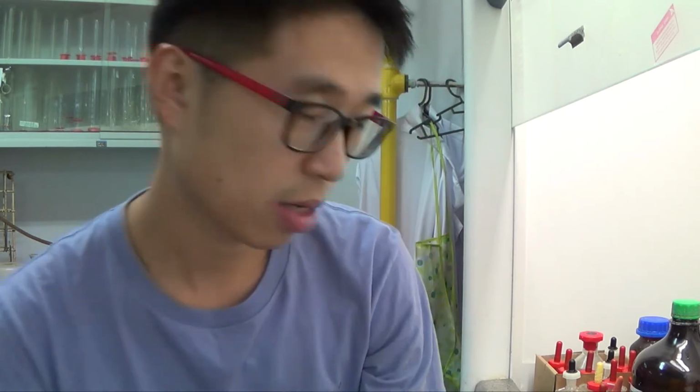Hello guys, so back with me on this copper 2 chemistry. I'll do an array of tests and show you some of the ligand substitution reactions that are typically part of the copper 2 case studies, and afterwards I'll do the cobalt 2 case studies. This forms the majority of the A-level syllabus on transition metals. So let's get started.